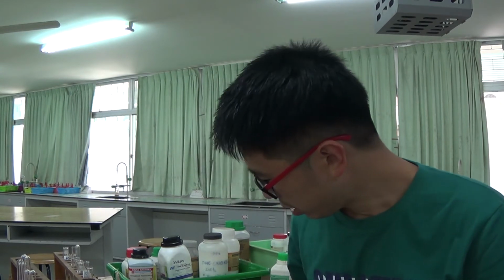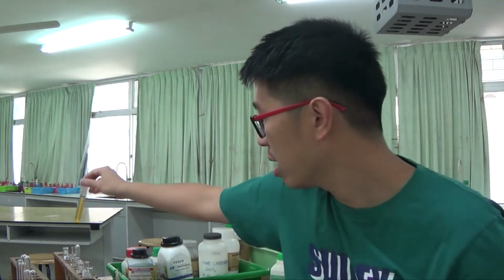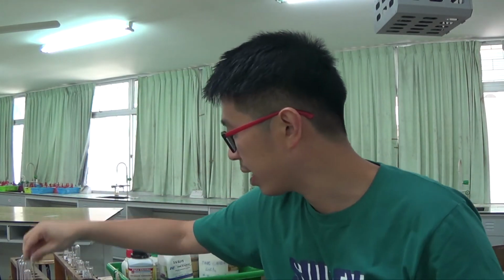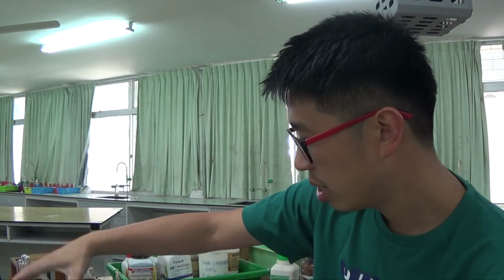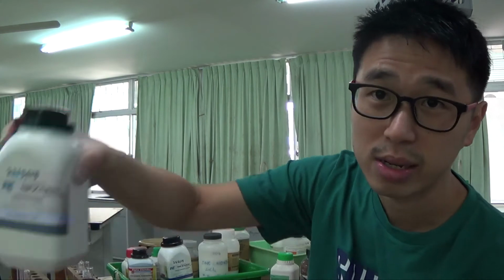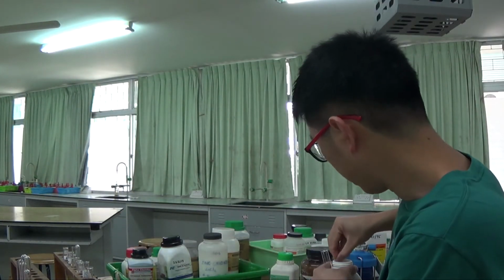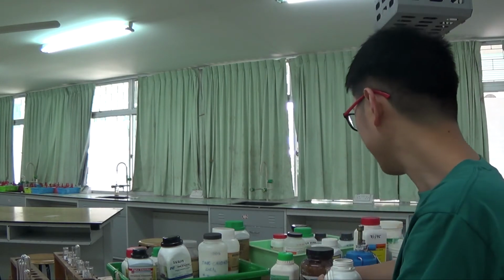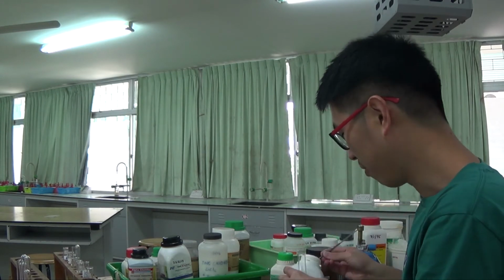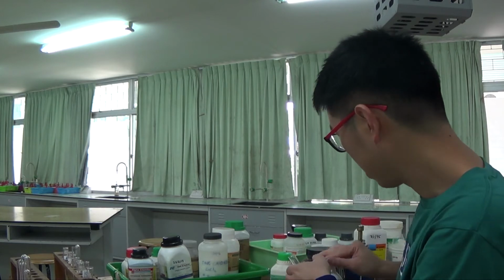Okay, so now I'll go through the next cation, which is actually in the O-level or the IGCSE syllabus, which is the copper 2+ cations. The copper 2+ that I'm using is the copper 2 sulfate hydrated. So it's usually given as a blue color solution in your exam. So when you see a blue color solution, most likely it has copper 2+, but do not take it for granted, okay? So always test for it and confirm the identity, okay?